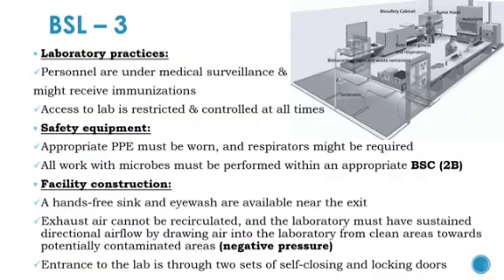The laboratory must have sustained unidirectional airflow by drawing air into the laboratory from the clean areas towards potentially contaminated areas by negative pressure. The entrance to the laboratory is through two sets of self-closing and locking doors.